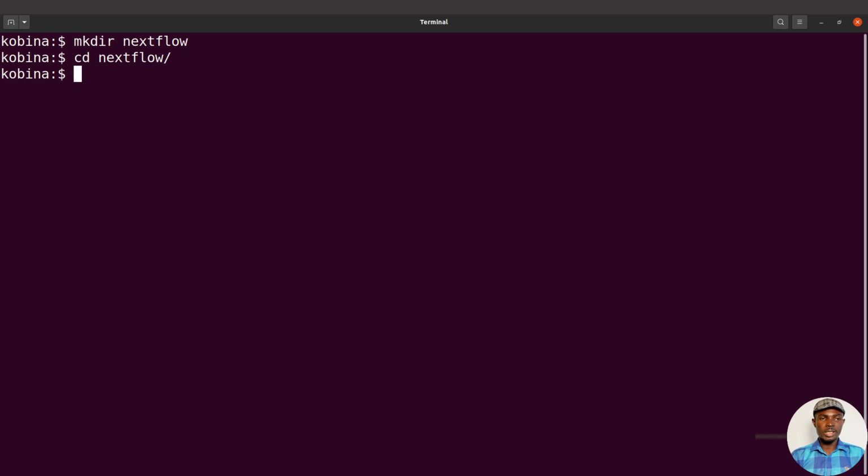So we have cd'd into it. What's next? What we are going to do next is to download the example data. We will need FASTQ files, that's the raw reads. We will also need the reference sequence. All right, so we are going to start with the FASTQ files, that's the reads.